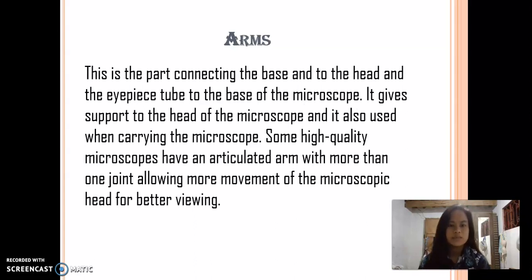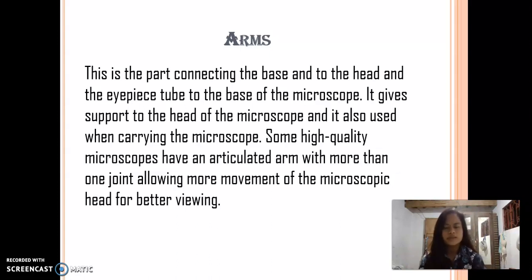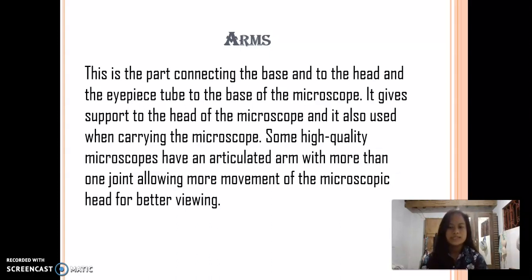Arms — this is the part connecting the base to the head and the eyepiece tube to the base of the microscope. It gives support to the head of the microscope and it is also used when carrying the microscope. Some high-quality microscopes have an articulated arm with more than one joint, allowing more movement of the microscopic head for better viewing.